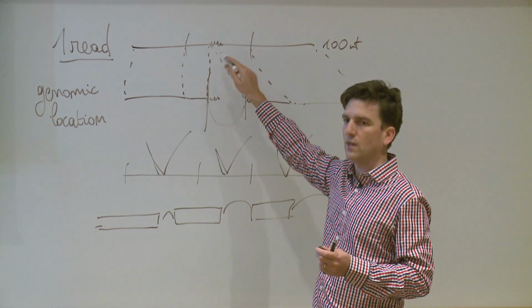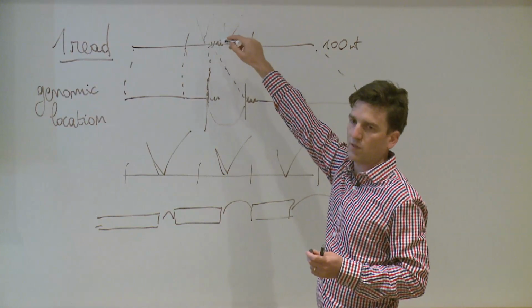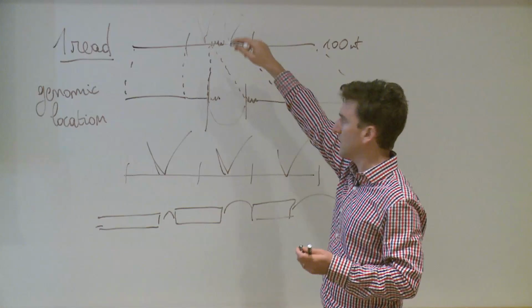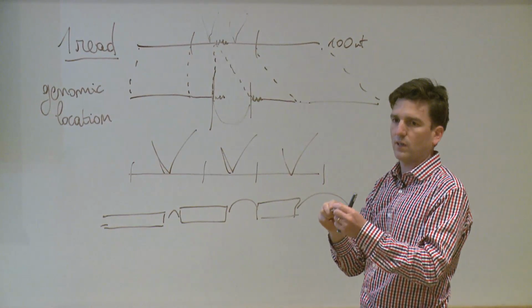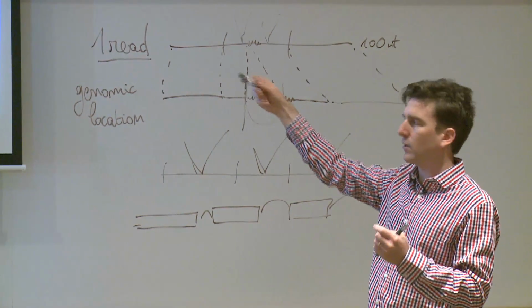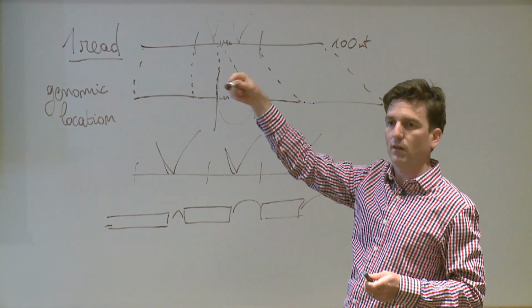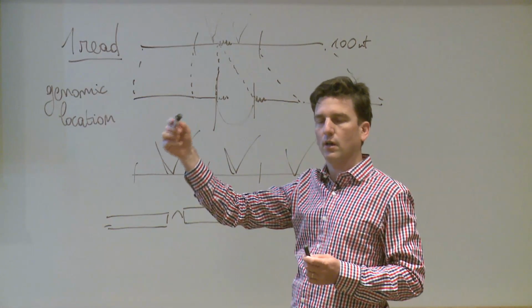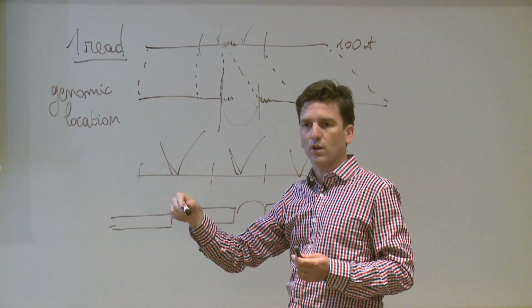Okay, where does this fit? And maybe this part has a mini exon in the middle, or maybe there are some mismatches here that make it hard to find. But there are multiple strategies for that. The idea is really that out of a 100 nucleotide fragment, and again, that algorithm was developed when the reads were probably 50 nucleotides, the likelihood that there are 2 splicing junctions is actually quite low. And even if it's low, you can take it into account.